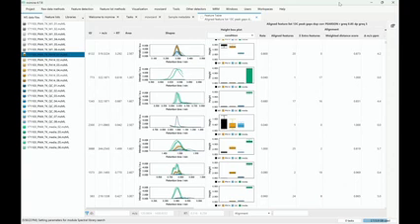Also, I have to say, stable isotope labeling always comes up so far. We're very focused on specific analytes and technologies. Actually, in the lab where we come from, there was a lot of different mass spec, so also ion mobility. Steffen has been building a lot of that. But of course we have our own focus. And now there's one guy coming in, Matthias, and he's building all the stable isotope labeling things, so it's in the making. And if you have data or ideas, you can always reach out. We have a Slack workspace where you can also connect with him, and then you can work together on trying it and also giving feedback.